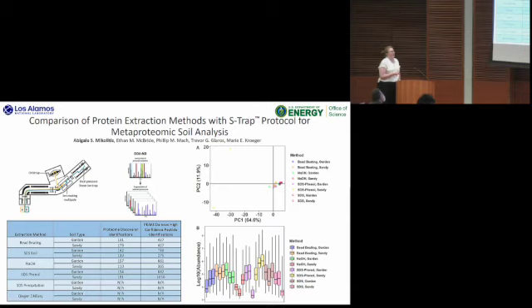And then with our de novo peptide identifications, there's a bit more variation, and you'll notice that the SDS phenol has the highest counts out of the other methods, but counts aren't everything. It doesn't mean it's the best method. So we're gonna move on to these 2 figures.